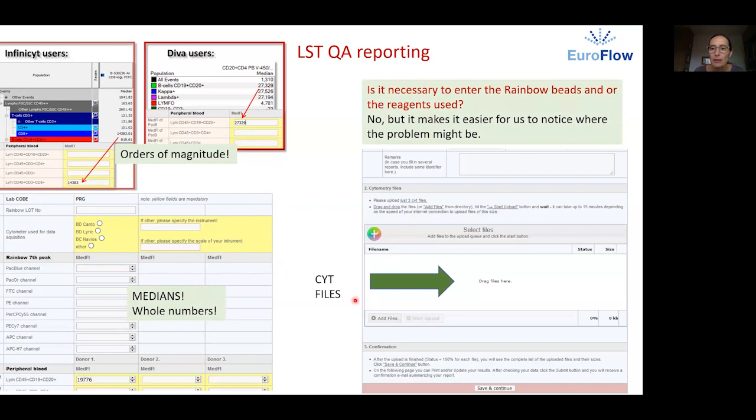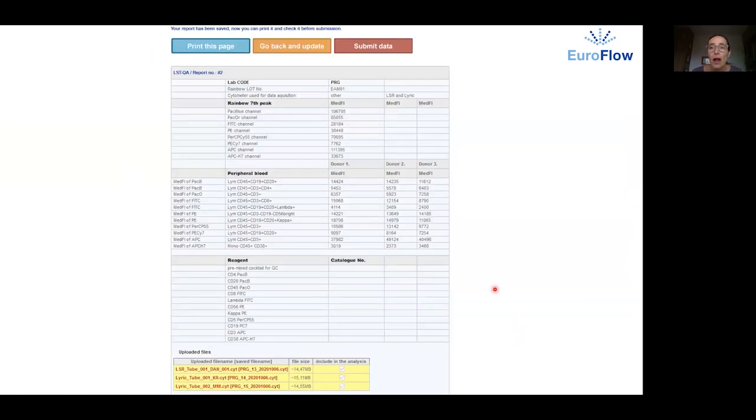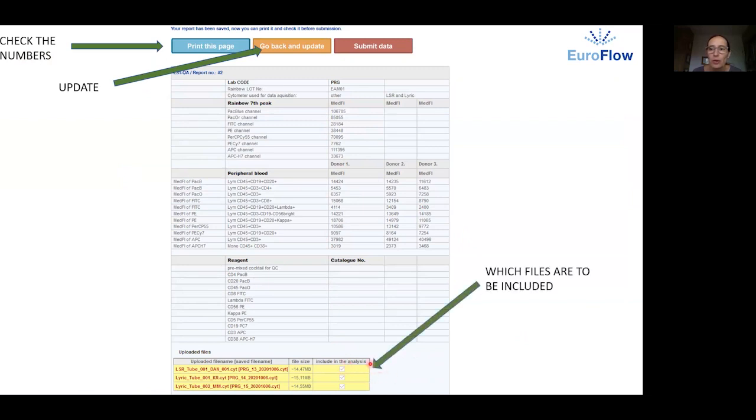When uploading the CYT files drag them here and click start upload. This might take several minutes. When the upload of all three files is finished which you should see here in the status window and size window click save and continue. Do not upload FCS files or any other types of files except CYT files. After saving you can print the filled form and check the numbers and files. If you find an error you can go back and update the form and you can control which files we will use for the analysis by marking them in this include in the analysis field.